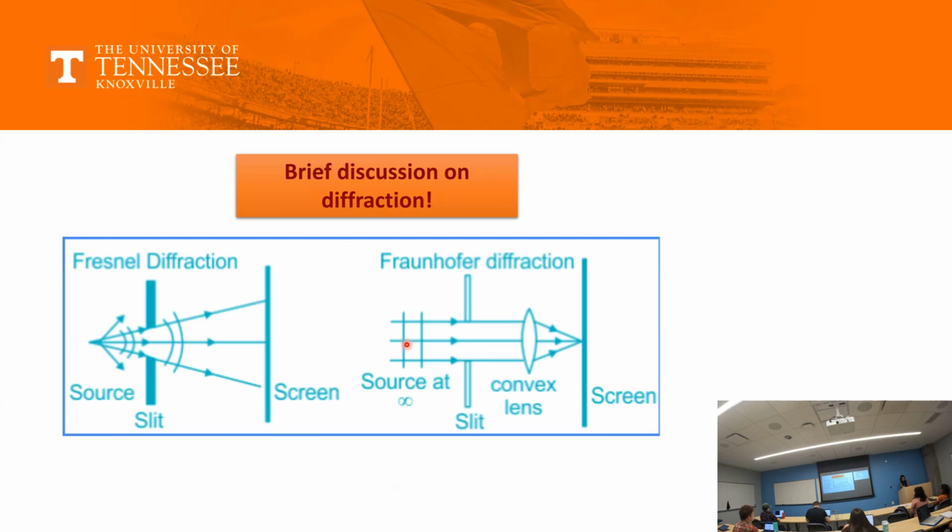Now we come to something about diffraction. The class will become a little bit, 2-3 lectures would be slightly tough. Everyone has Williams and Carter now, right? You are going through it slowly. And the other book that we have is Loretto and Smallman. If you go to Steve, he would always give you that small green book. So both the books are good.